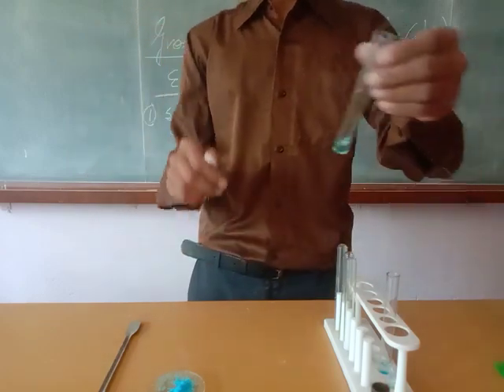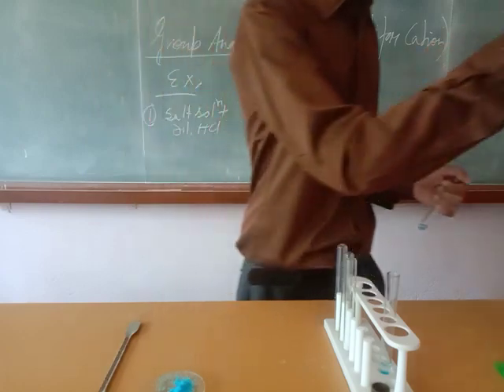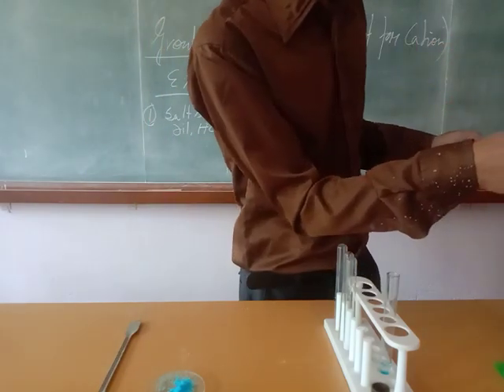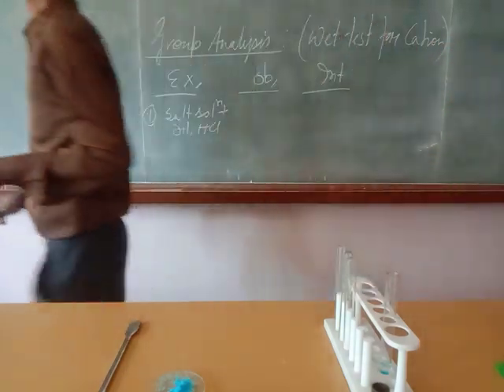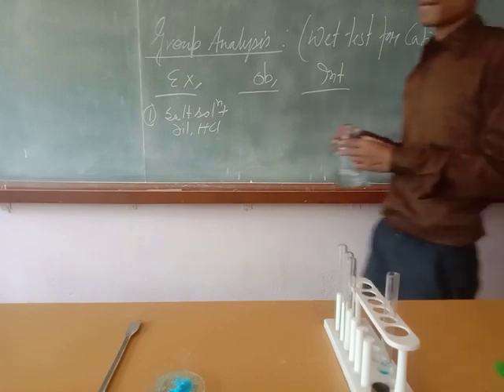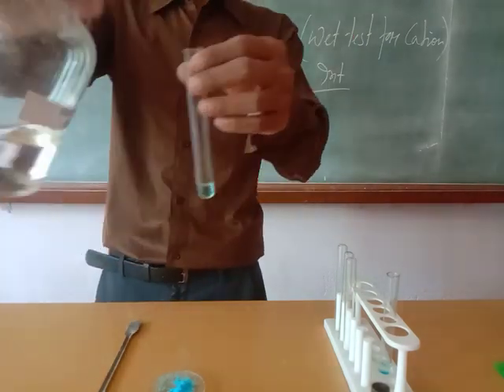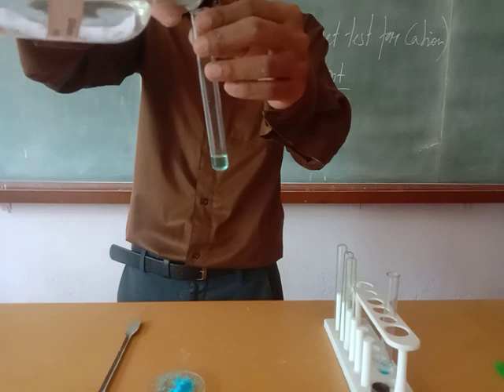So I have prepared the salt solution, then you put dilute HCl. So this is dilute HCl.